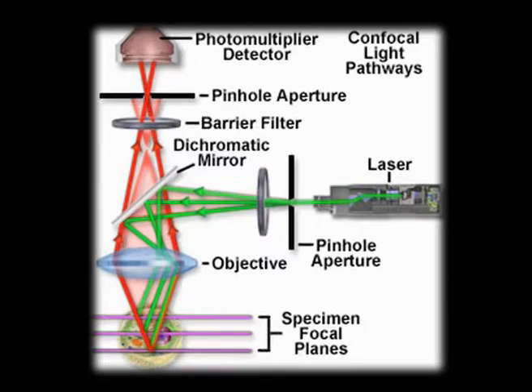What is a laser scanning confocal microscope? Now, the basis of confocal is the presence of a pinhole. So, after the light source, which is in most cases the laser or the mercury arc lamp, once it passes through the excitation filter, it crosses a pinhole. The pinhole is adjusted so that the light is focused to a particular region of the specimen or the object.